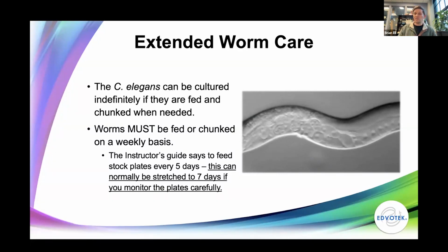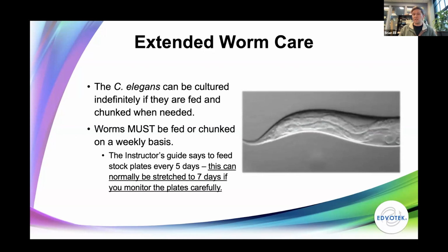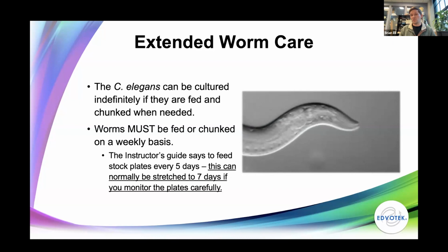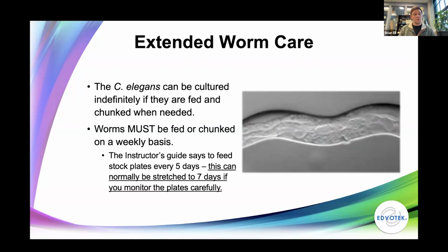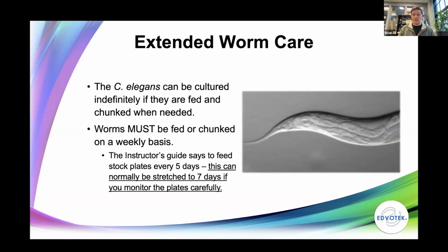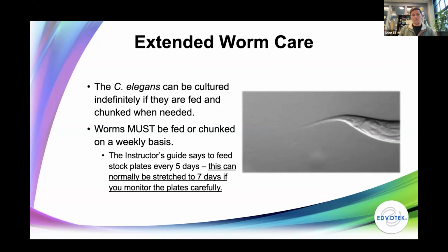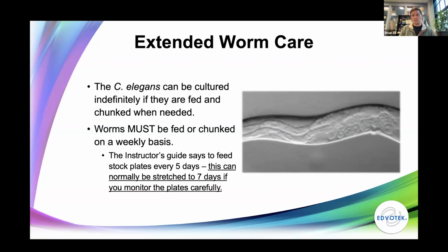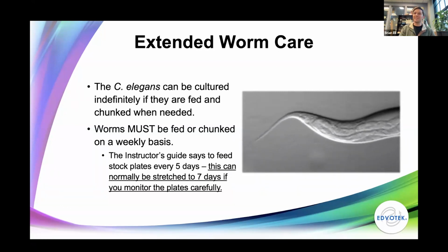When it comes to some of these bigger breaks, Thanksgiving is relatively easy because you can let them go for this week without any problems as long as you feed them or chunk them immediately before it. For winter breaks, since that is a little bit longer, the worms will be okay over the length of it, but you do need to make sure that they are pretty healthy when you are going into it. So I want you to chunk them or feed them immediately before you leave.